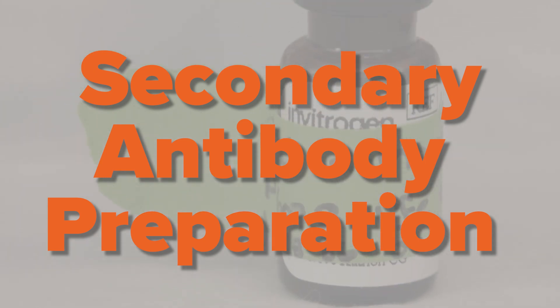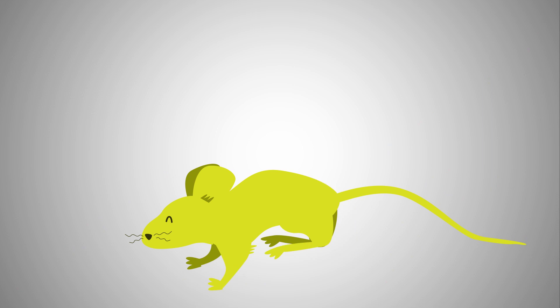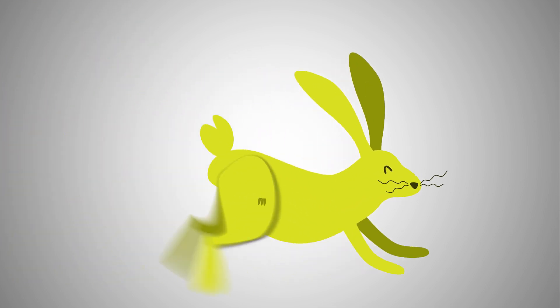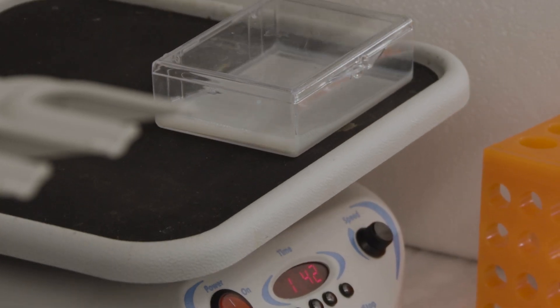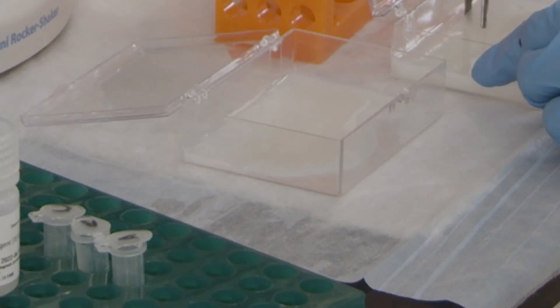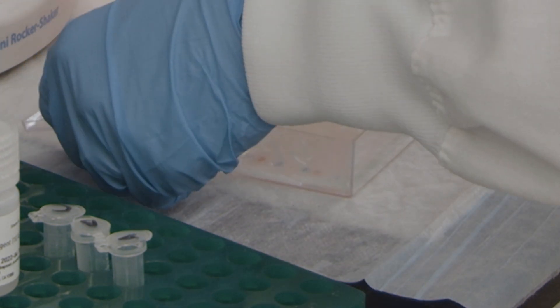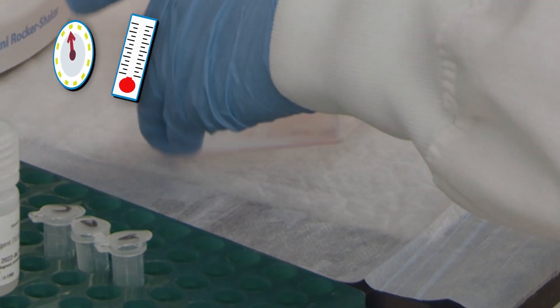If your primary antibody is unconjugated, prepare the secondary antibody during the wash step by diluting to the desired final concentration in the blocking buffer. The secondary antibody used will depend on the species that the primary antibody was derived in. If the primary antibody was made in a mouse, use an anti-mouse secondary antibody. If the primary antibody was made in a rabbit, use an anti-rabbit secondary antibody. Your antibody data sheet will have appropriate dilutions, so use that as your guide. Once the washes are complete, transfer the membrane to the diluted secondary antibody solution and incubate for one hour at room temperature.